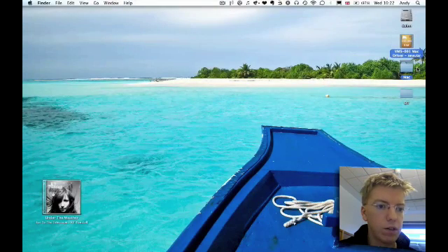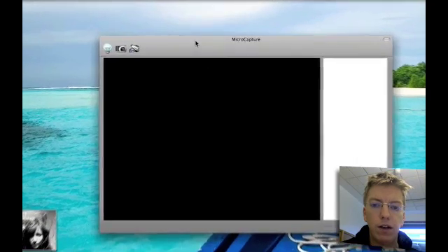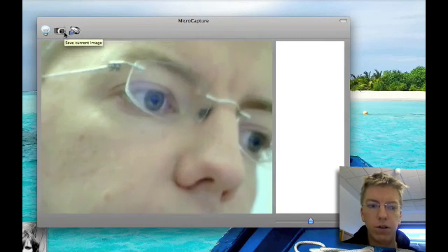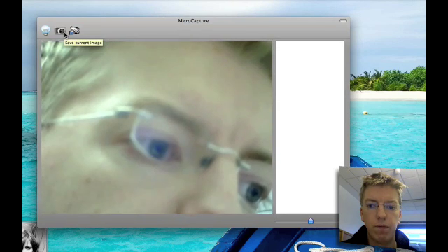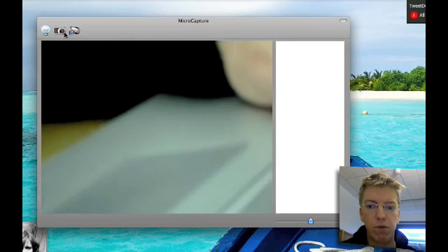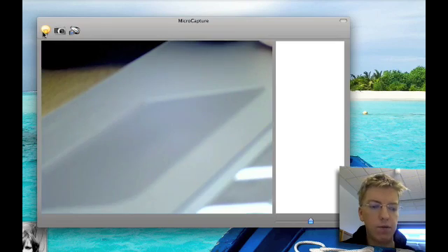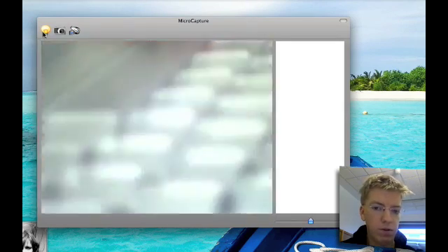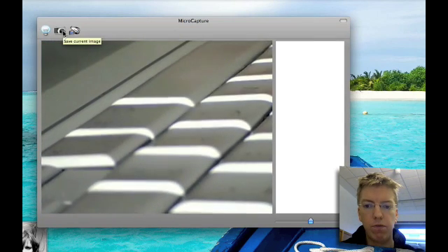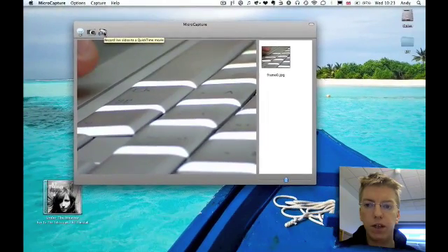I'll just delete that stuff now and then launch MicroCapture. I've already got the microscope plugged in. And here we go — it's pointing right at me. I can adjust the camera, changing the focus, and point it down at my keyboard as well. I can switch on the LED on the microscope by pressing that button there, so now things are a bit more lit up. This button will let me capture a screenshot, and this one would let me record some video. That's about what there is to it.